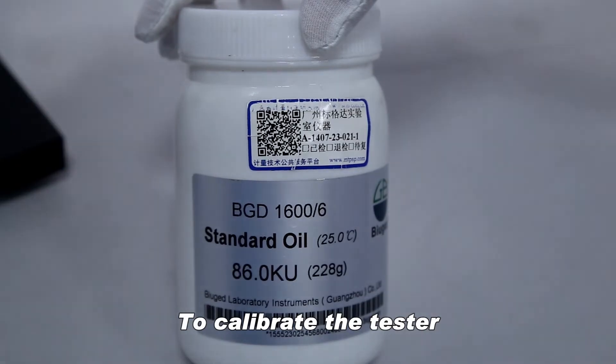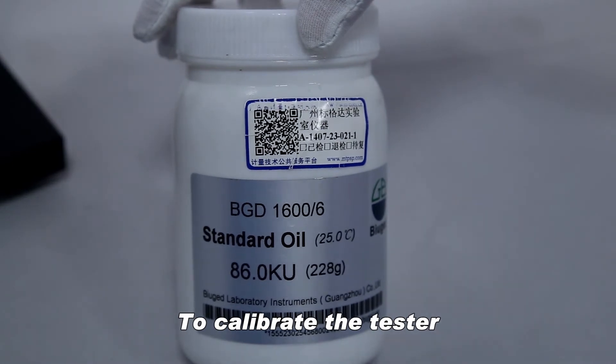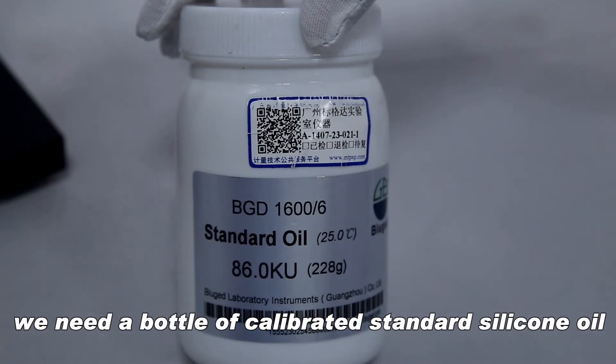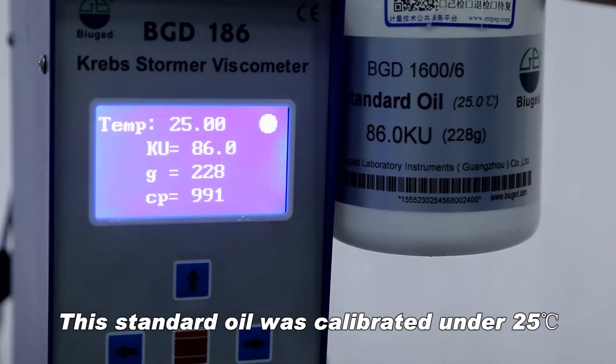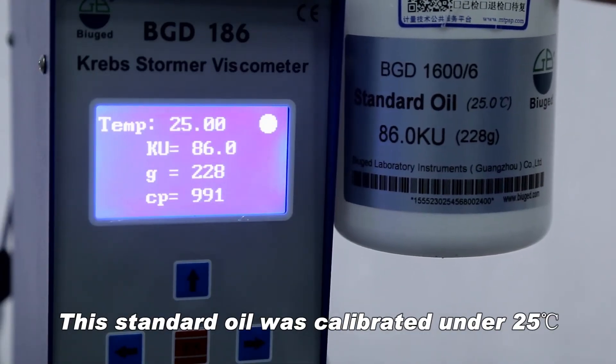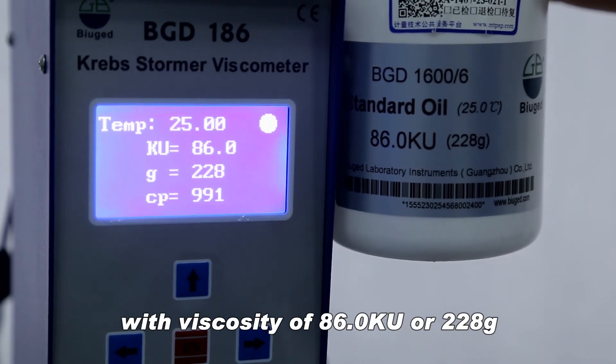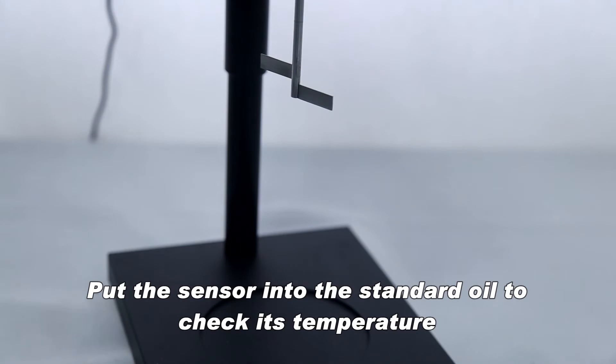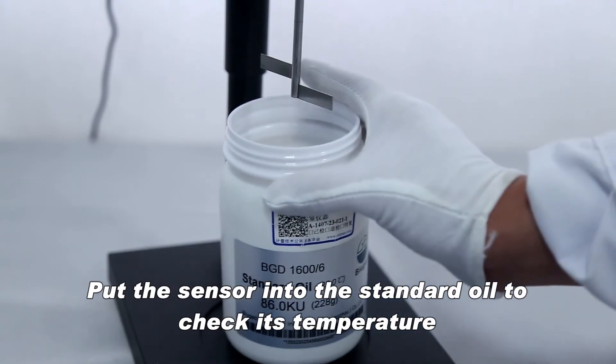To calibrate the tester, we need a bottle of calibrated standard silicone oil. This standard oil was calibrated under 25 degrees Celsius with a viscosity of 86.0 cou or 228 grams. Put the sensor into the standard oil to check its temperature.